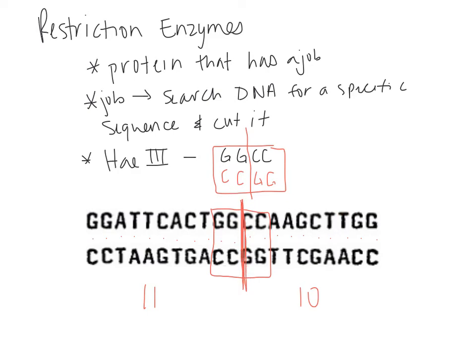Now, remember, in the real world, we don't know where it's cutting. We can't tell because we just see a vial of liquid. So this is just to illustrate so you know what's actually happening on a molecular level.